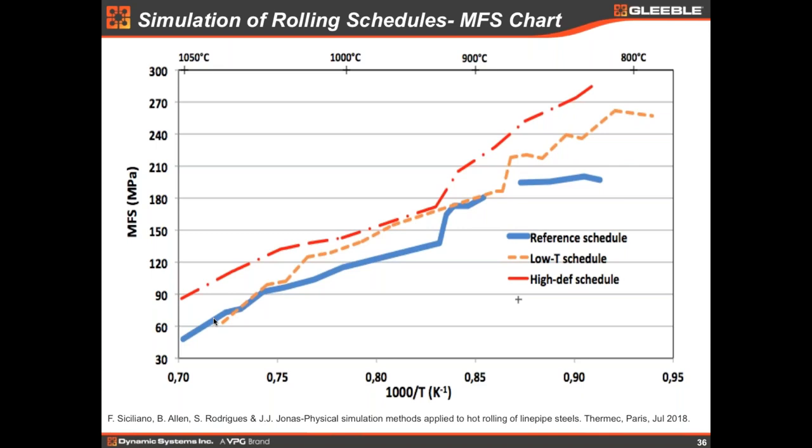So in this way, usually you have a steady state if you have only recovery, and the process parameters will influence the recovery, and this will generate a specific subgrain size. And even if you have pancaking, you still have the subgrains being formed inside the grains. If the grains are elongated in the pancaking process, you have the subgrains inside, and usually they keep the same size for the same temperature, same strain rate and same applied strain. So they remain at the same size inside. So this is a recrystallization at high temperature subject. I also can come back to this point privately later on with some figures.